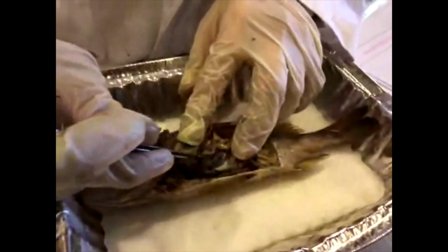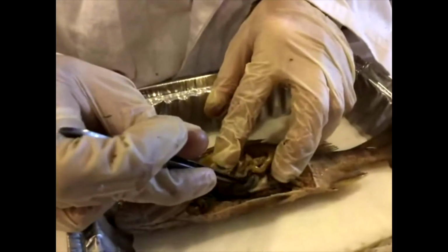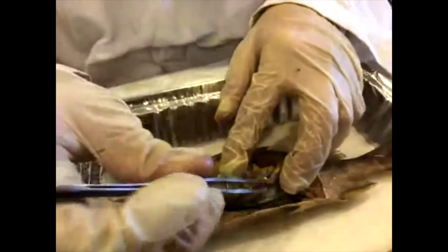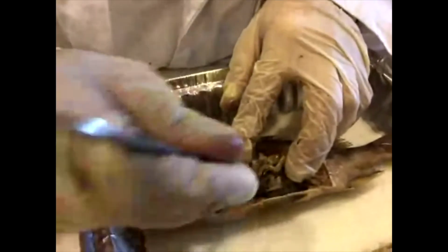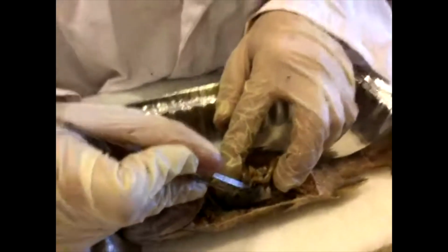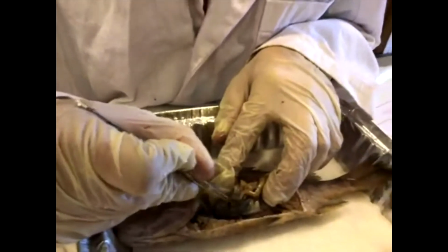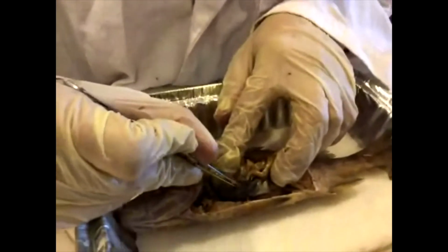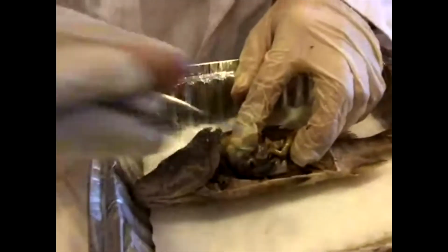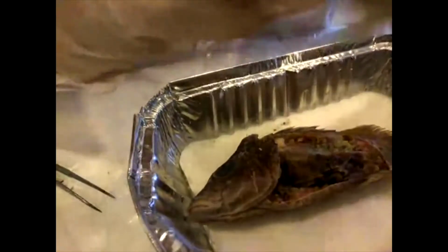is your spleen. It sounds like a silly name for an organ, but we have spleens as well. And spleens also have a role to play in filtering blood to remove anything that's maybe toxic. And they also are really important in the immune system. So the spleen kind of produces, maybe not antibodies, but blood cells and whatnot that you can use to fight off infection. So we've got those. I'm going to quickly cut into the operculum to see if we can get the heart out of this one.